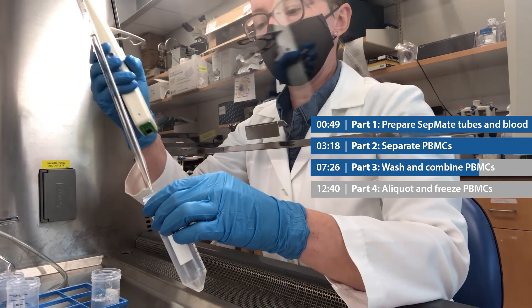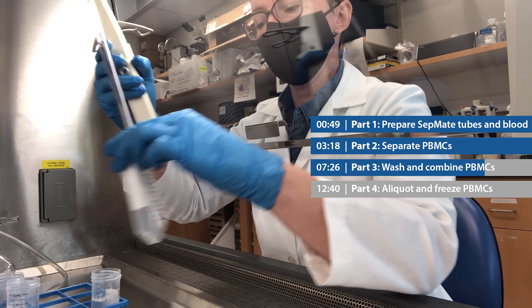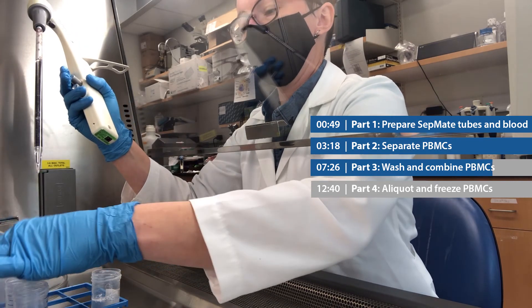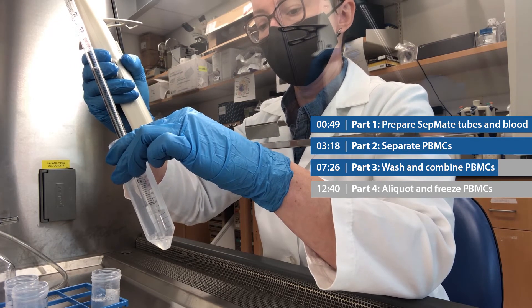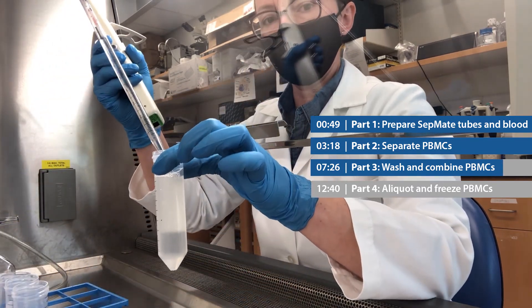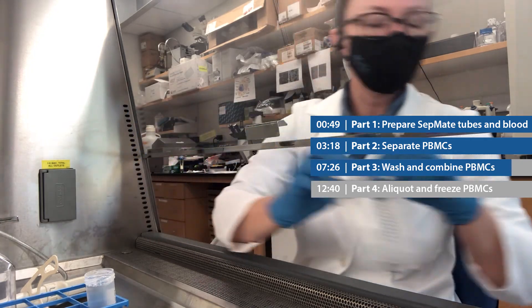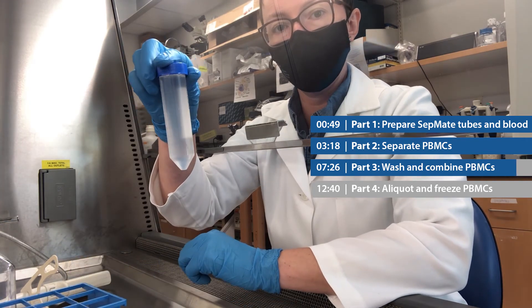I'm going to take 10 mils of DPBS and put it into the first tube I emptied, pipette up and down to pick up any leftover cells, then add it to the second tube, and then the third tube. Now I'm going to add this to the 40 mils I have here to bring it up to 50. These three rinsed tubes can get thrown away, and the one tube with all of my cells in 50 mils of DPBS will go to the centrifuge.